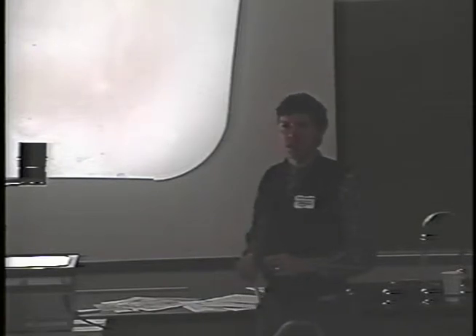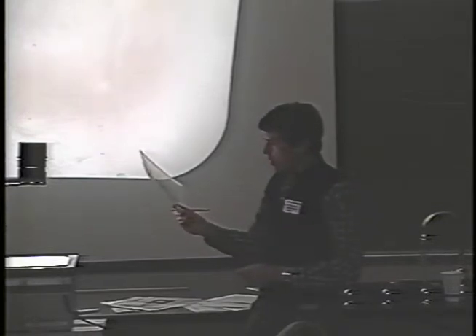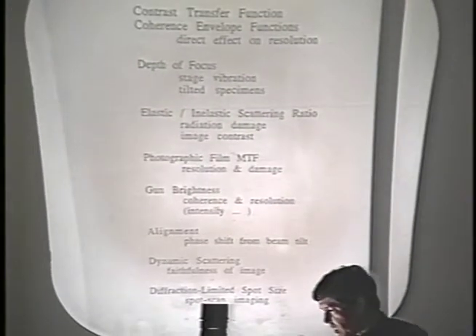That's not a practical thing to do, though, because when you look at the image, the electron exposure is so low that the lattice lines are extremely noisy. There just are not enough electrons to expose the image to a level that's well defined. And this is one thing that we'll probably come back to shortly here. But still, back to these things that are better at high voltage.